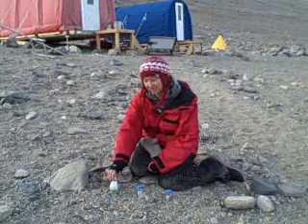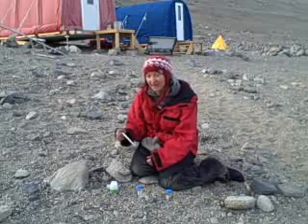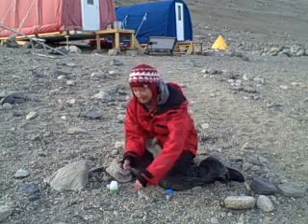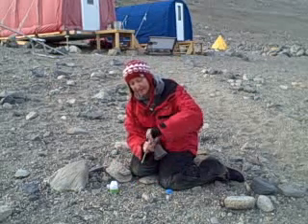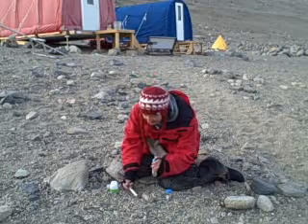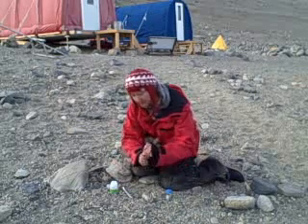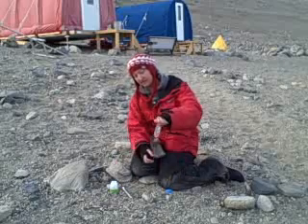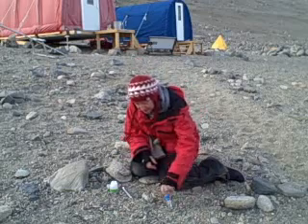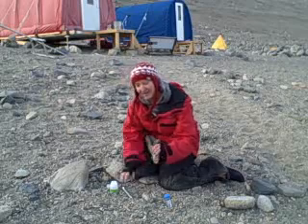For our next set of tubes, we're going to see if there's microorganisms living in the sediment on the ground we walk on. So we first want to put it in there, shake it up, make sure it gets all mixed up. And there's one of our tubes. Then we take our other tube, and we do the same thing.